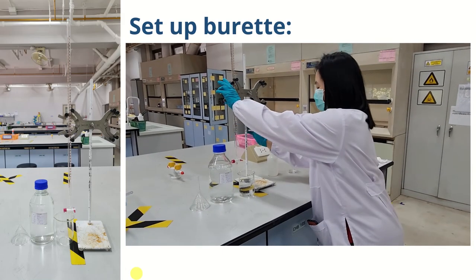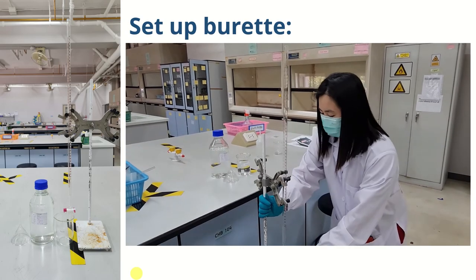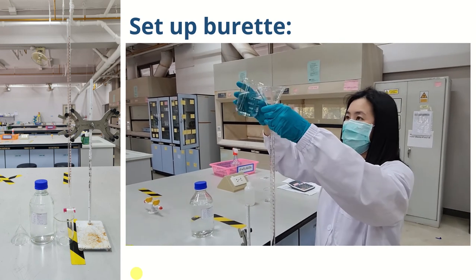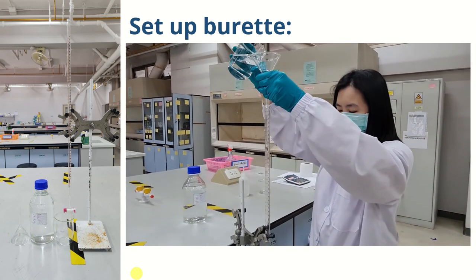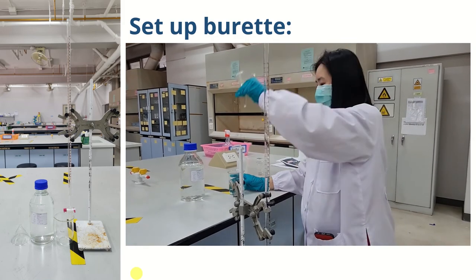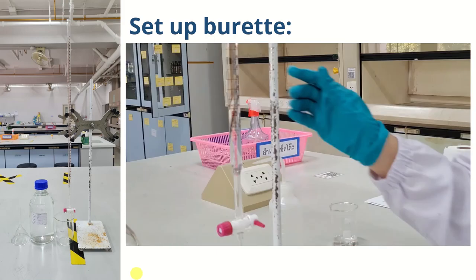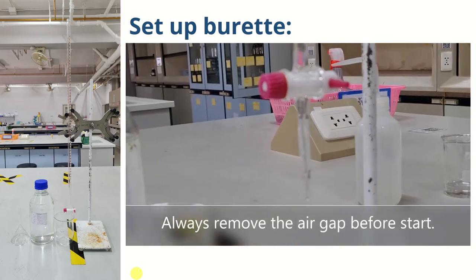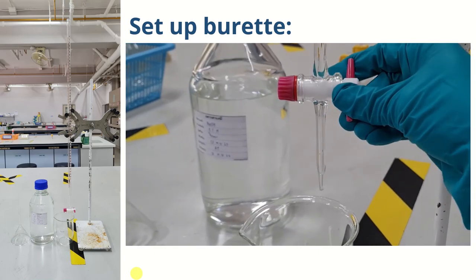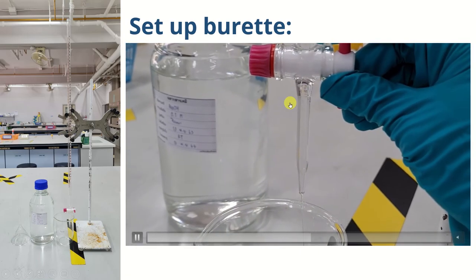Okay, put the burette back onto the stand and if you are not tall enough, bring it down to the chair and add sodium hydroxide in. The first time, don't add it up to the top just yet, because you need to check the air trapped at the end of the burette. Always remove the air trap here, okay?